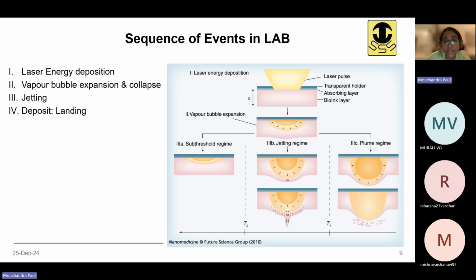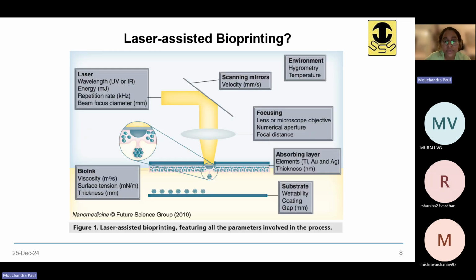When we are reducing the aperture size as well, the aperture size basically shows the focusing capability of the lens for the laser. If the aperture is very small, then not much of the laser light can pass through. If the aperture size is quite big, then most of the laser light falling on this lens can pass through. So it is basically the focusing capability of this lens.